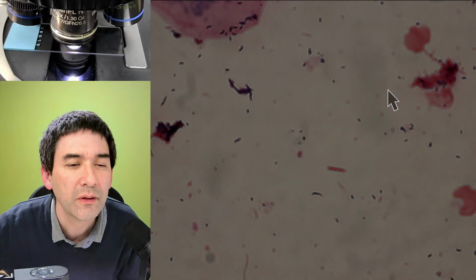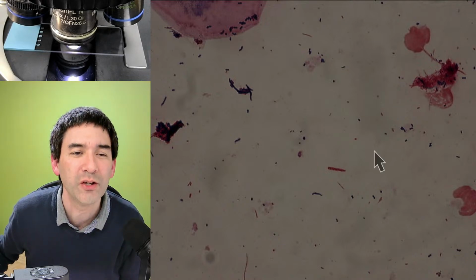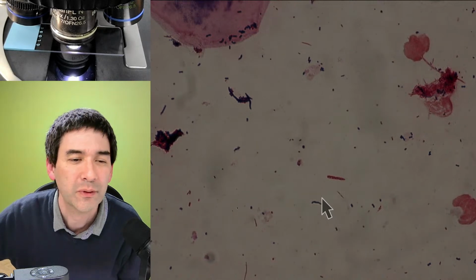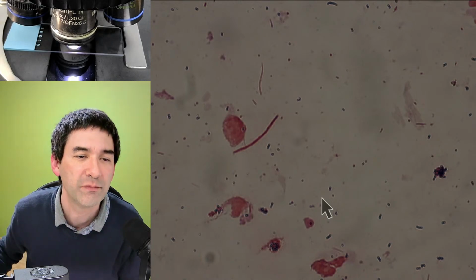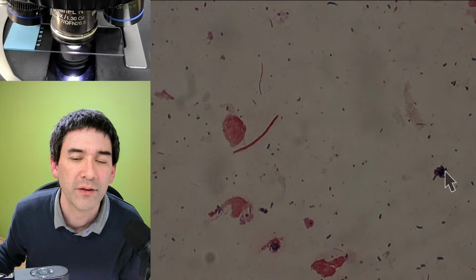I don't know. Look, could this be, it's a question of interpretation. Could this bacterium be a little bit red? Then it would be gram negative, right? Some of them are, and this one seems to be gram positive down here because it stains dark blue. Definitely, look, this one over here, a long rod-shaped gram-negative bacterium, because it stains red. These here are blue.